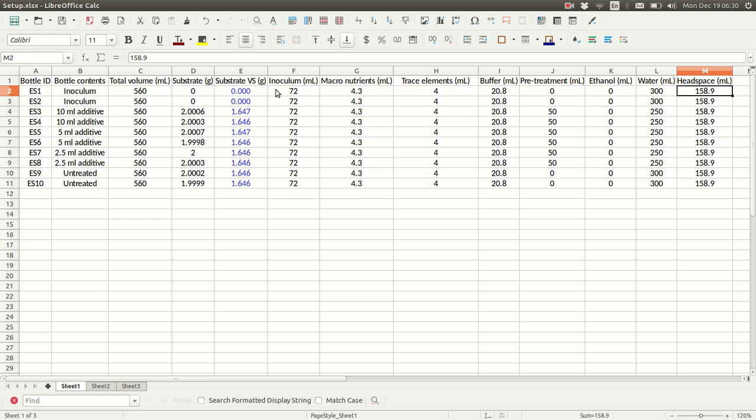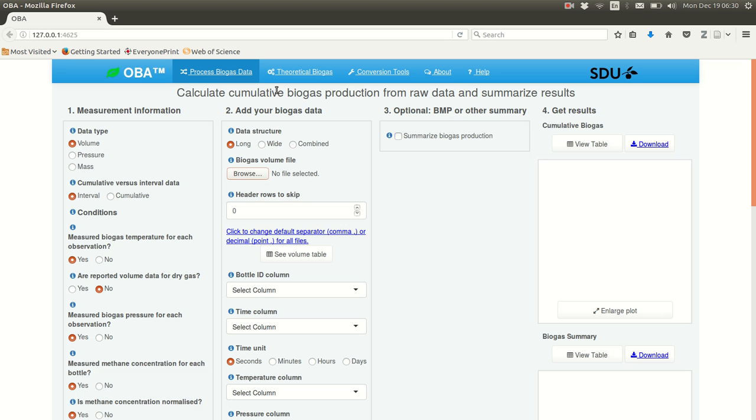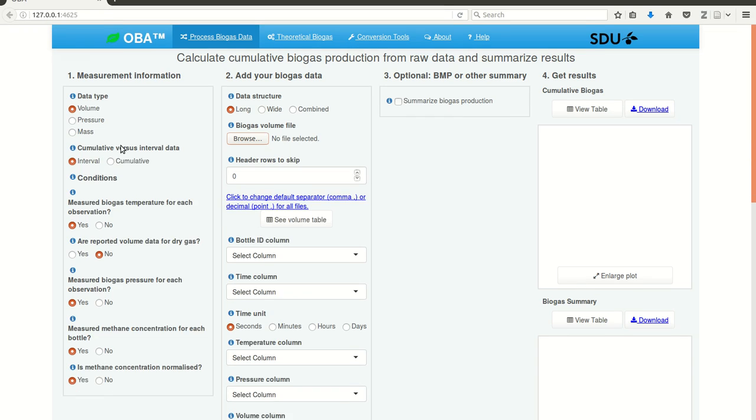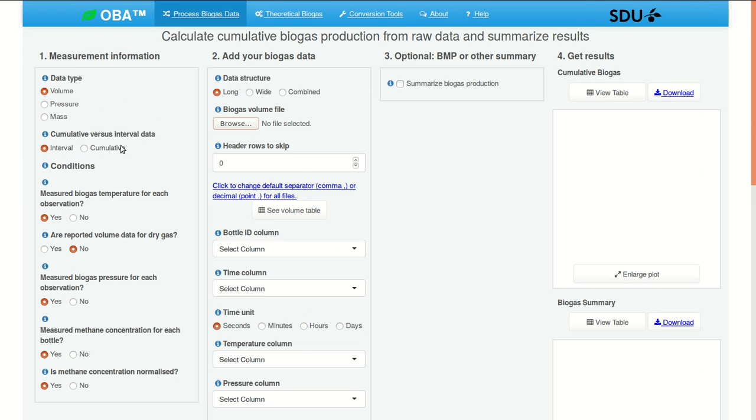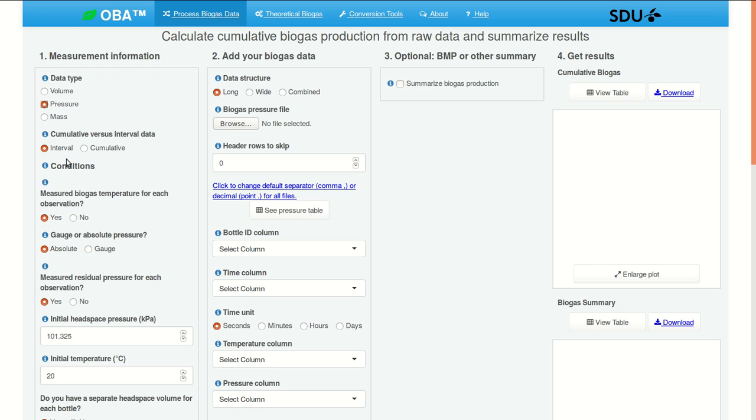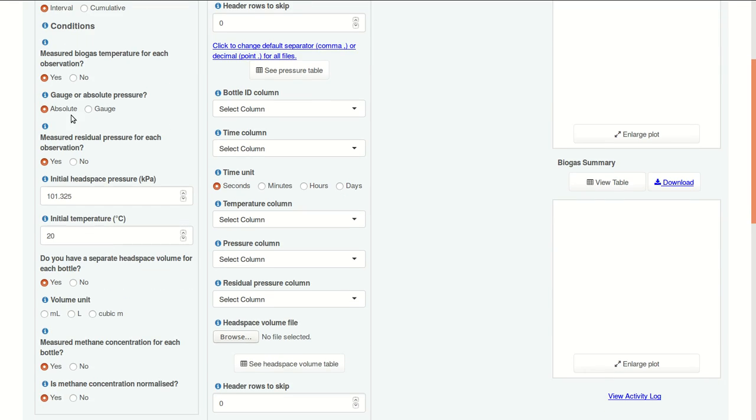And then for the manometric method, we need headspace volume as well. Okay, so let's go to OBA. We're working with pressure data. These are interval measurements. The bottles are vented after each measurement interval. And we do have measured biogas temperature for each observation in our data file. This is absolute pressure. And we do have measured residual pressure.